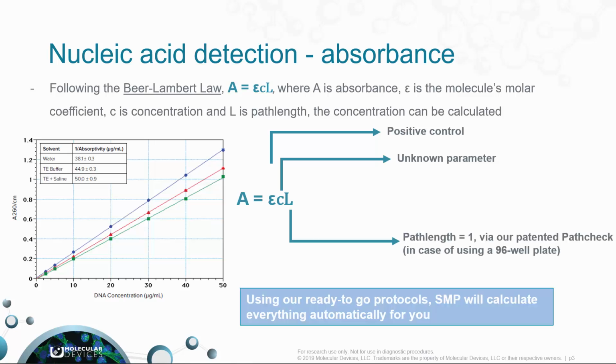With the use of the ready-to-go protocol in SoftMax Pro, all the calculations have been created for you, meaning you don't need to worry about it and the software will calculate it for you.